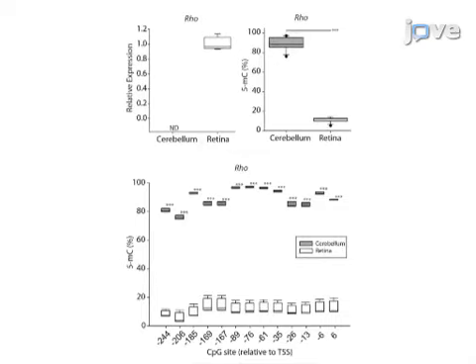Ultimately, bisulfite amplicon sequencing, or BSAS, can be performed to precisely and accurately quantify the CpG methylation in any region of interest from any model organism.